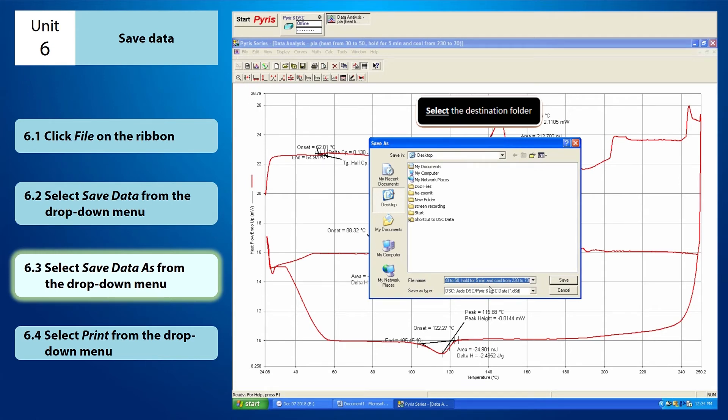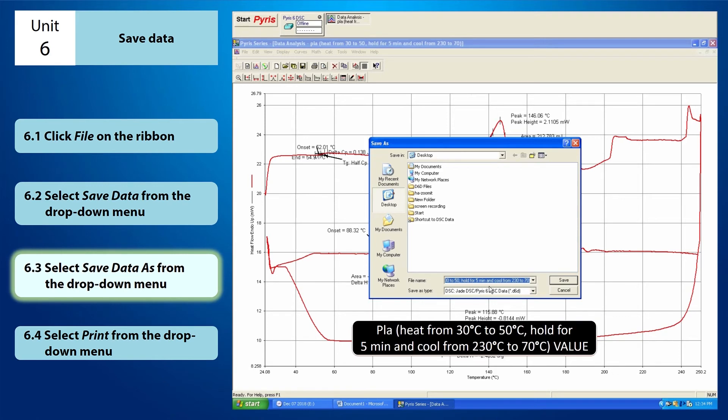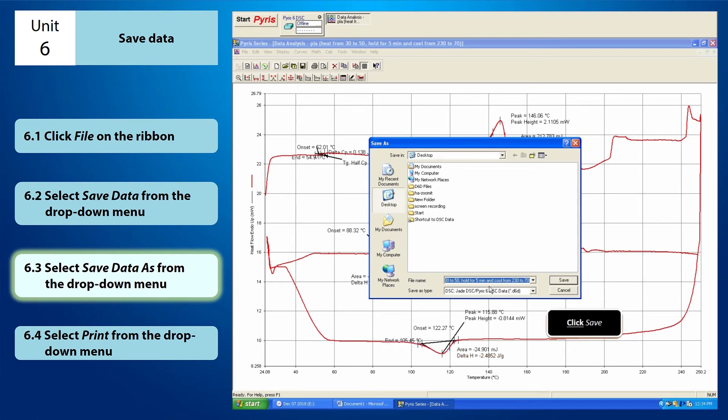While saving your data, you have to enter new file name so that it won't rewrite the original file data that you wish to keep. For instance, I'm going to save my file on the desktop. And I'm going to rename the file as PLA in bracket, heat from 30 degrees Celsius to 50 degrees Celsius, comma, hold for 5 minutes and cool from 230 degrees Celsius to 70 degrees Celsius value. And click save.